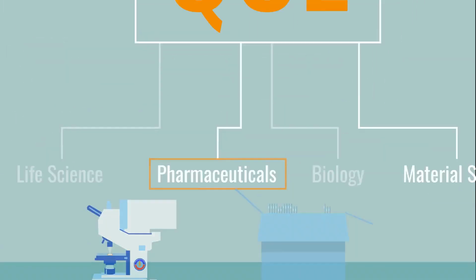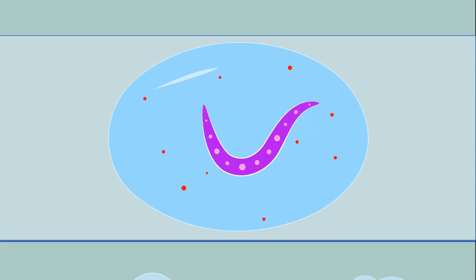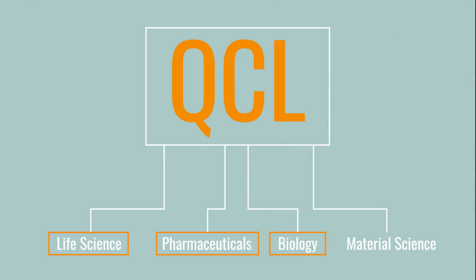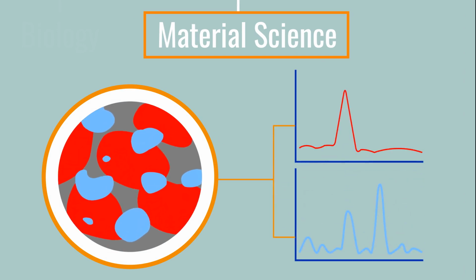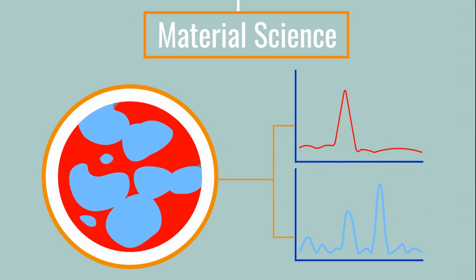But more importantly, QCL opens the door to completely new infrared microscopy applications. Currently, QCL is used to study the movement of live microorganisms in water and to monitor yeast fermentation in microbioreactors in real time. Naturally, life sciences are pioneering QCL technology. But a huge potential lies in the real-time investigation of dynamic processes in material sciences to reveal physical and chemical reactions on a microscopic level, at video frame rates.